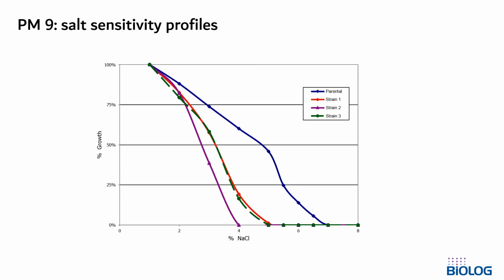So our observations for the client were that the parental strain and daughter cell lines were all leucine auxotrophs, and all 3 daughter cell lines were more sensitive to sodium chloride concentrations. So they need to include leucine in the production media and manage their salt concentrations.